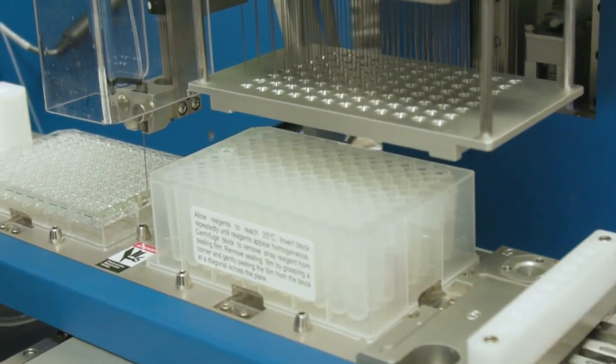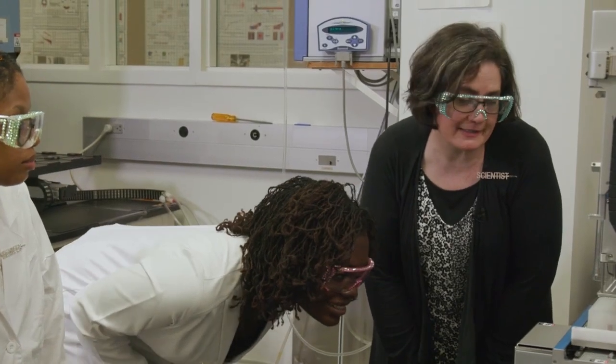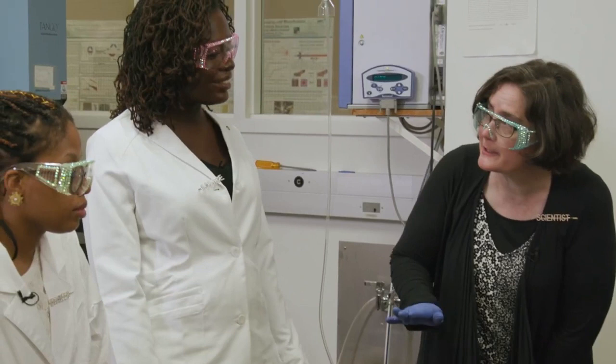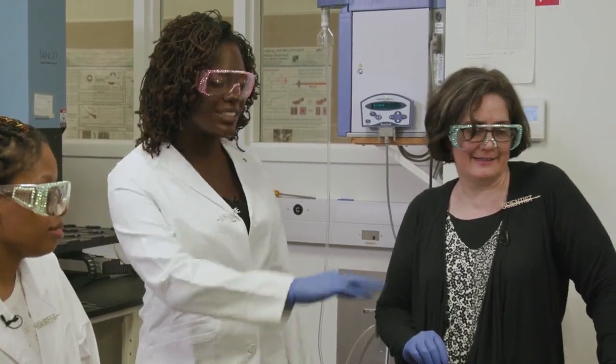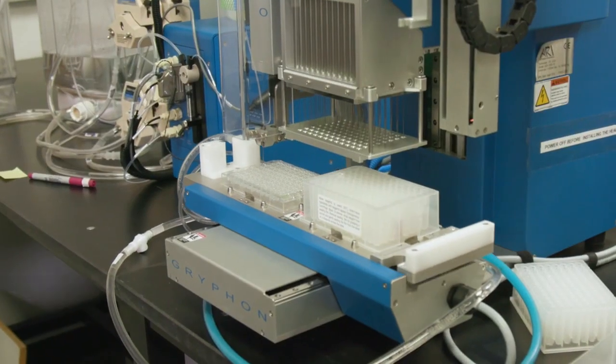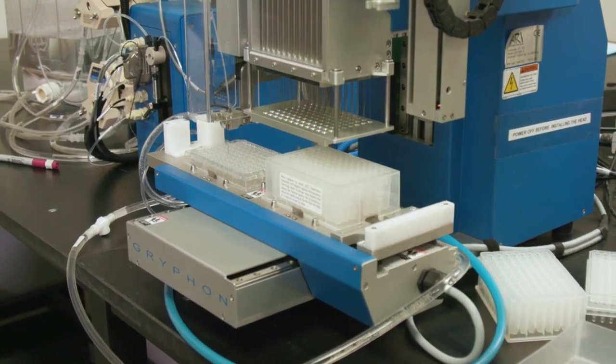You may have to wait till we look at it under the microscope or in the imager to be able to really see it. That is incredible. But you'll be able to see it's really there. It's really dispensing stuff out. I can see it looks like a tiny little sneeze from this needle. Essentially, everything in these pipettes is going to come out with a lot of precision.